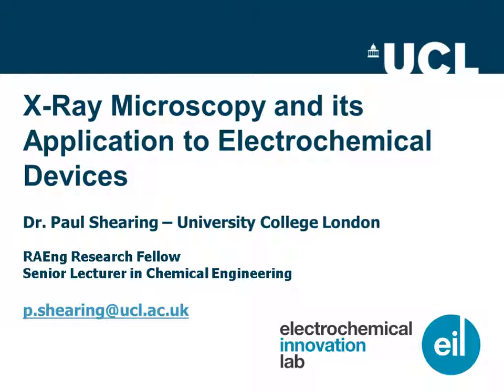I should mention that most of the talk is going to be on X-ray microscopy and tomography, but at UCL, in addition, we have a suite of ZEISS focused ion beam instruments, and we're really excited to explore the capabilities of the correlative microscopy opportunities with X-ray microscopy, ion beam microscopy, as well as the light microscopy that Arno mentioned. And I know that later on today, Arno will look towards the future and the intelligent ways that we can combine all these different modalities to begin to get a multi-length scale, a multi-time scale, and a multi-modality approach to materials characterization.